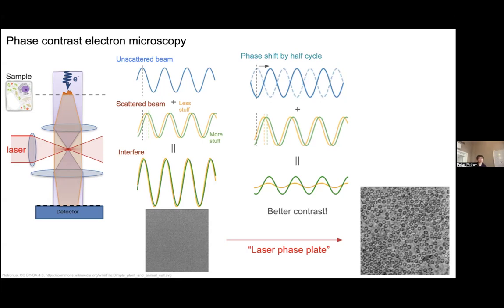It's interesting because the amplitude contrast is kind of the alternative to phase contrast. And the reason that we are pursuing the phase plate is because it's been observed that the way that the atoms in the molecules interact with the electron is that they phase shift it. But if you were to see a lot of amplitude loss because of scattering, then you'd also be interested in the amplitude. So one of the things you could do for samples that have a lot of phase shift and a lot of amplitude loss is take two images, with and without the phase plate, to get both of those components of the wave. Okay, awesome, thank you.